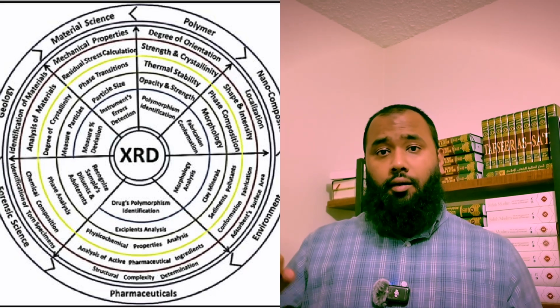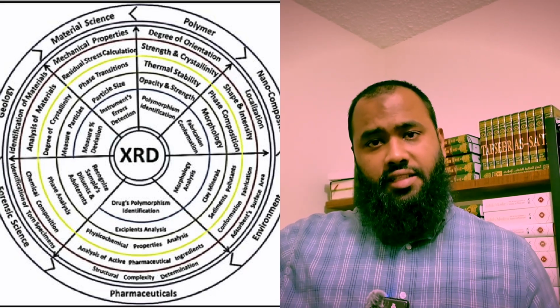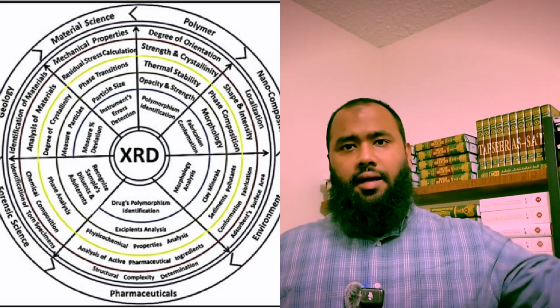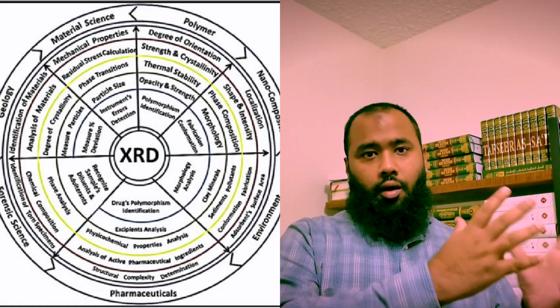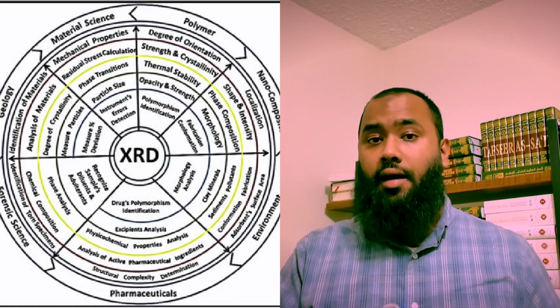It has a very far-reaching impact because XRD is being used day to day in every industry. I work in the cement and concrete industry, where cement producers use XRD and XRF every day to identify the crystal phases in the clinker. On the other hand, pharmaceuticals are always trying to identify the proteins they are synthesizing and characterize those materials.